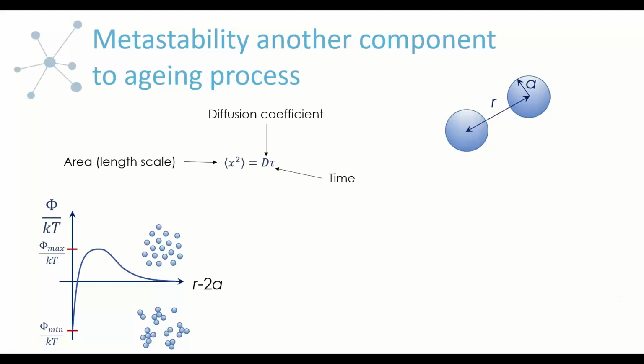When these are in balance, like in the case of proteins, we can observe some interesting phenomena. We can observe reversible clusters, so clusters that form and then one protein in the cluster gets knocked off and then is replaced by another. And these clusters are aggregates that stay in solution. That's key. So they still participate in the microstructure of the fluid. This we can think of as the influence of phi max, where the individual protein can still participate in cluster formation, and the cluster itself also participates in the solution.